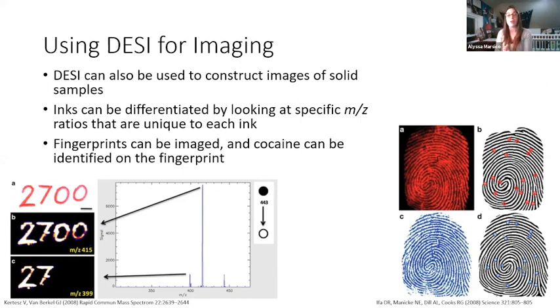Anybody looking at this photo, if you give them a brief explanation of what it shows, they'll say, oh yeah, that makes sense. The 0's disappeared because it's not the same ink as the 27. Now, how these imaging techniques work, actually, I do have a slide that talks about mass spec imaging.